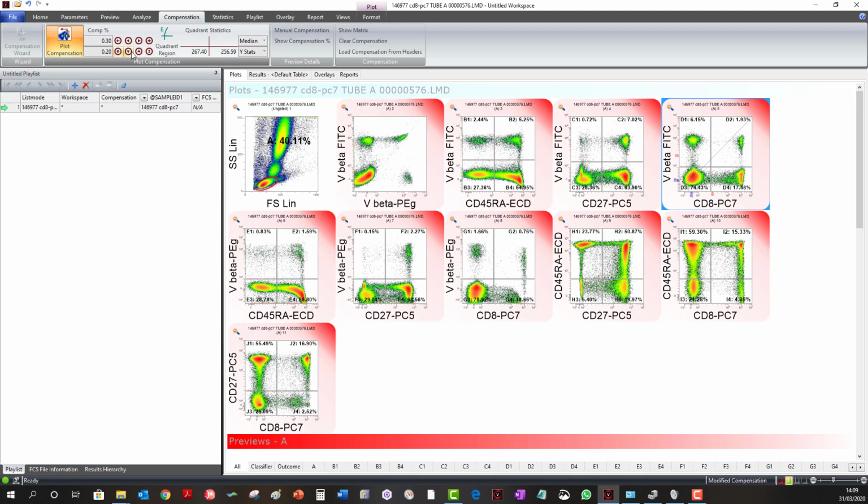Then using the single arrows as a more fine adjustment for the compensation until they're around the same values. So that's the Y statistics. If we check the X statistics, they look okay, but let's check them anyway. We can see that the numbers are already correct.